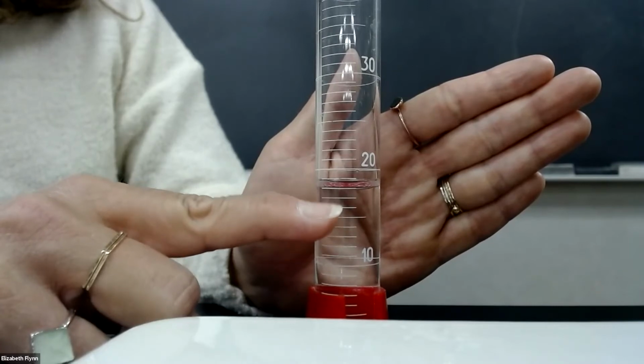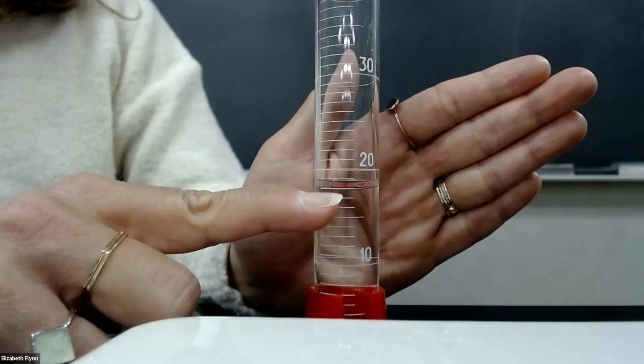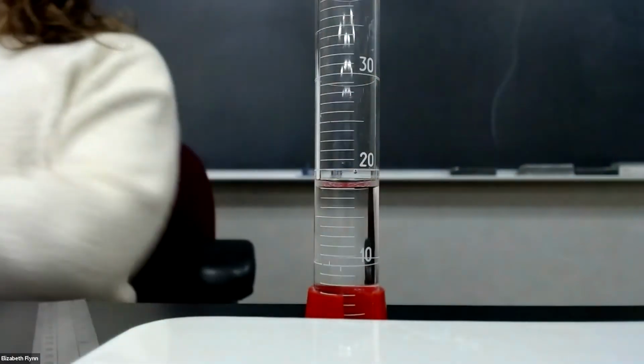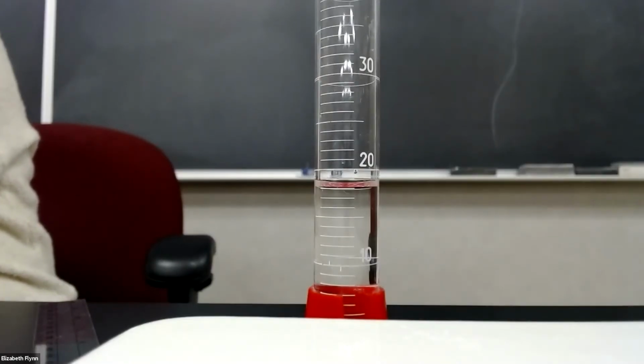We know for sure it's 17 because that's where the line tells us that it is, and in between, it's almost at the 18 mark. So we'll say 17.9 for the water in this 50 milliliter graduated cylinder. 17.9 milliliters.